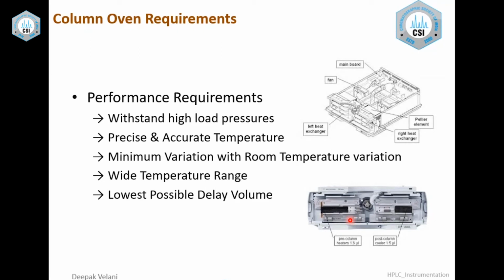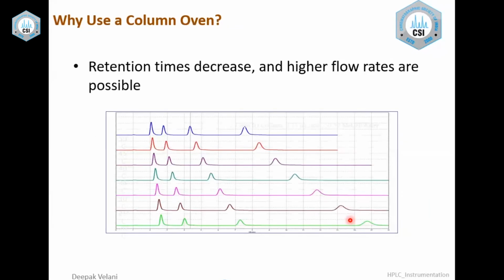If you vary the temperature, for example, in a mid-size organization that works in a general shift, you have the AC on during the day and you put a sequence on. At night there is no AC, so the temperature of the room is different, and then you find a variation in the analysis. This shows the variation because of temperature. As the temperature increases, you have an issue coming in terms of linear velocity.